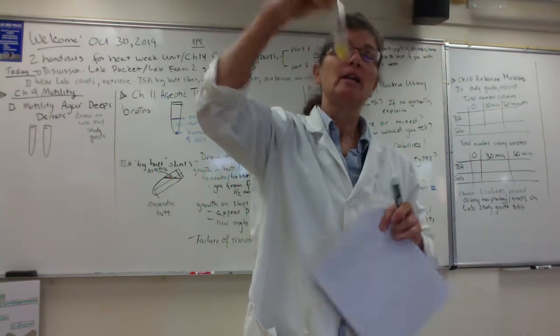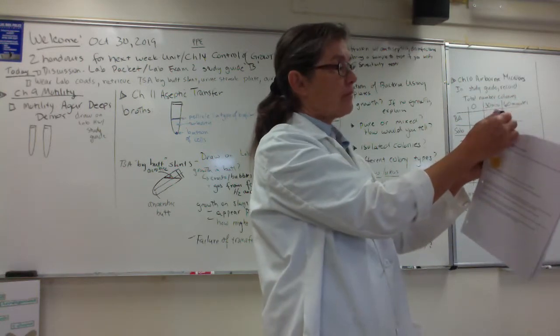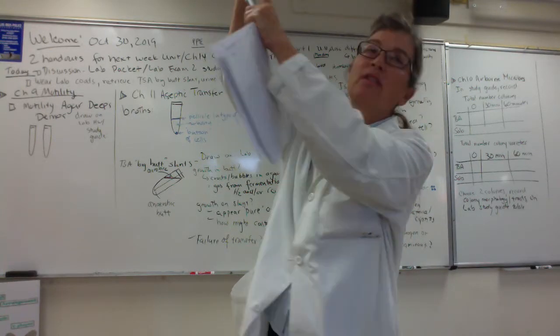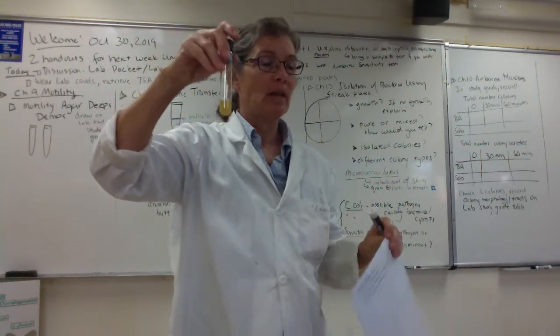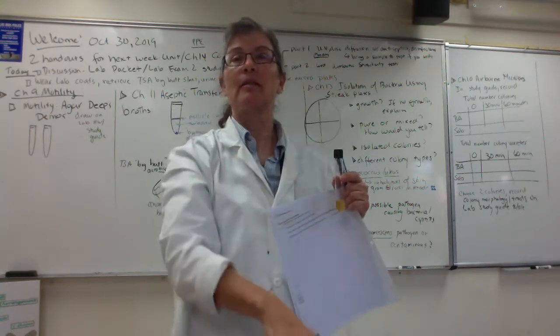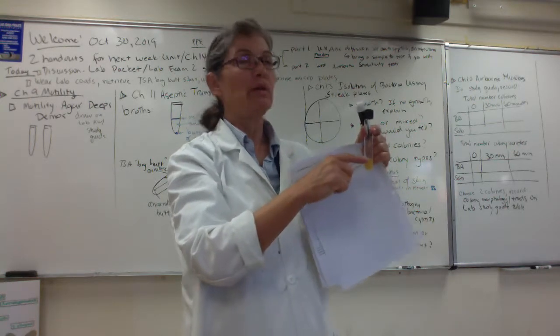Good. And then, folks, if you have a chance, you can come up here, tighten the cap here, because what you want to do is hold it up to the light and look at the bottom of the tube, and you can see a collection of cells at the bottom. That's referred to as a button or a pellet. And the reason I wanted to describe that is in some broth cultures, all the cells settle to the bottom, so that when you pull them out of the incubator, the broth appears transparent.